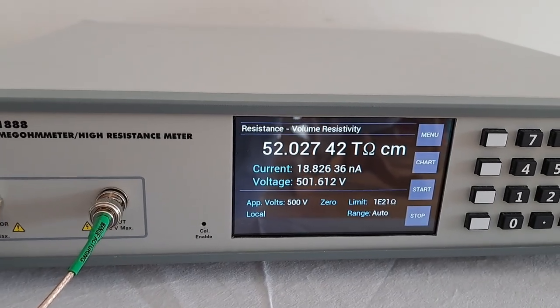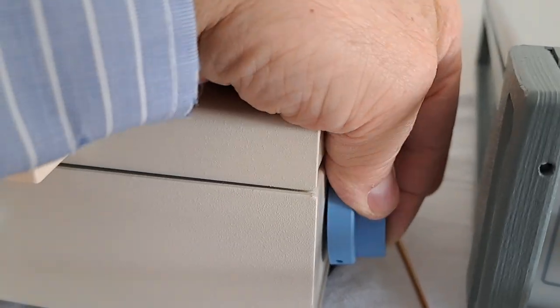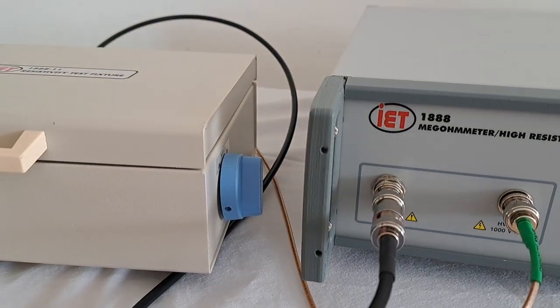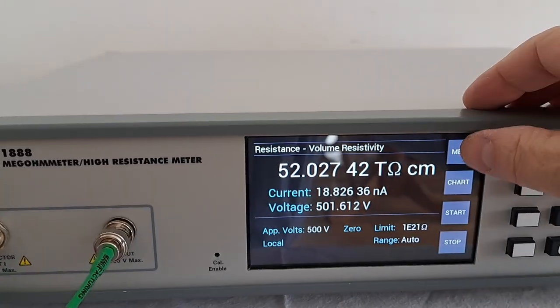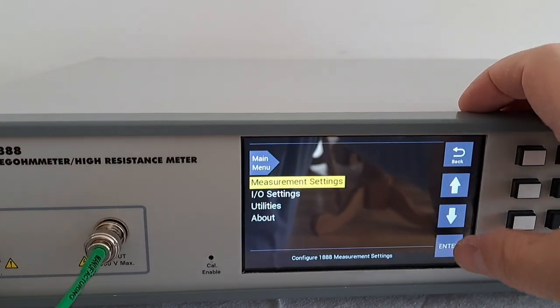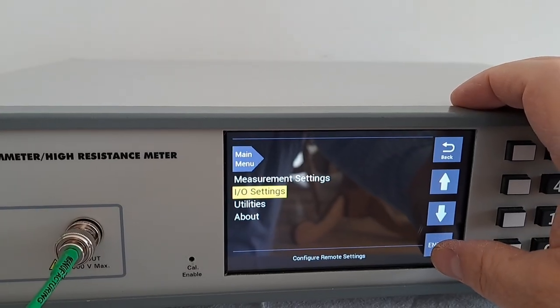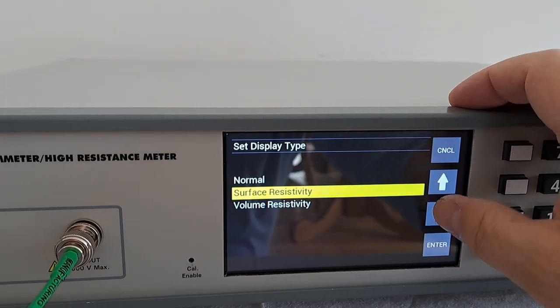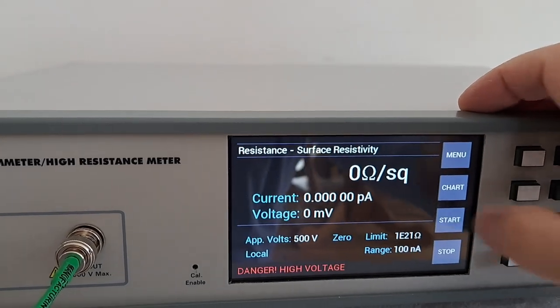If we wanted to change over and measure surface resistivity, it is as easy as rotating the switch to surface resistivity on the cell, going over to the 1888, pressing the menu button, going down to I/O settings, pressing enter, selecting surface resistivity, and pressing start.